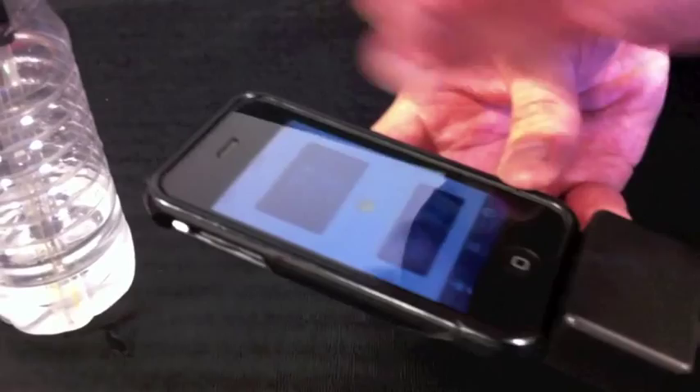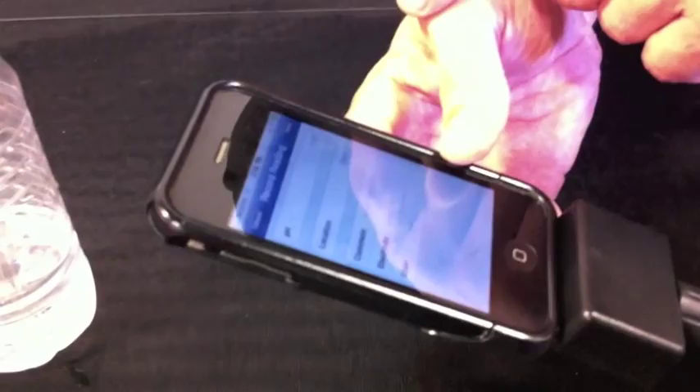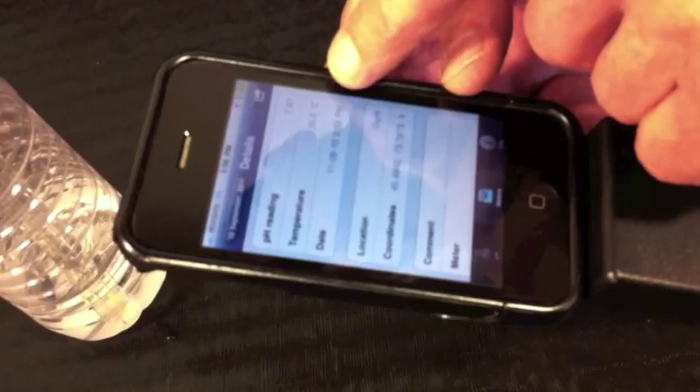So we record a reading — we tap on the screen and hit save here. Now we've recorded that reading. Later I can go back, take a look at the reading and I can see the value of it, the temperature, the date it was taken, where it was taken, and the coordinates that it was recorded at, and any comments that I'd entered in it.